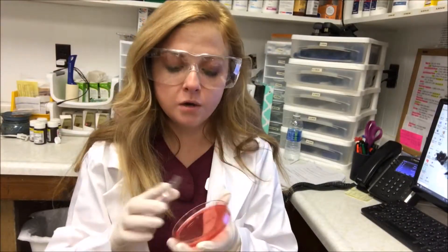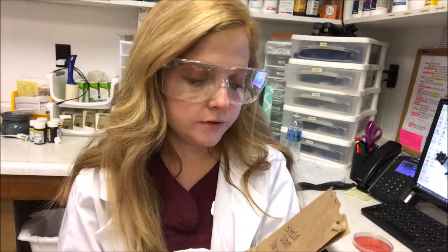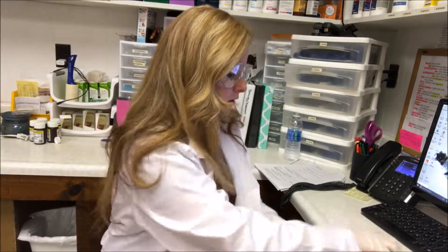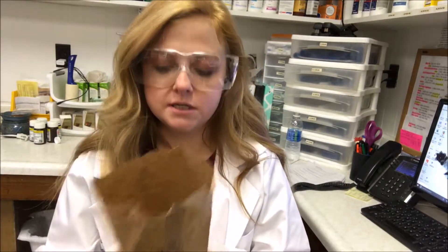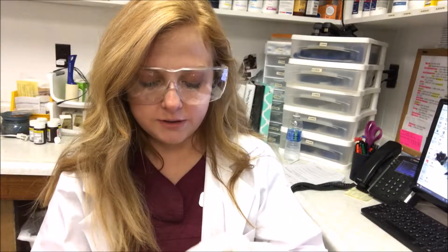We have our agar plate here. I've got a bag labeled with the animal's name for bacterial culture with today's date. I'm going to put this culture down in the bag and then sit it in a dark spot for the next 24 hours. I'll check it tomorrow, and then we're going to put some antibiotic discs on it to see if we have any growth reaction.